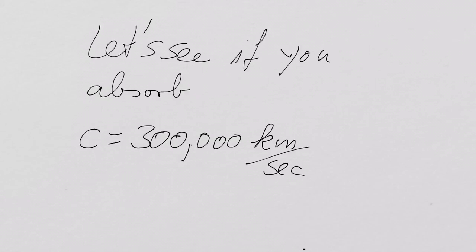Right? Okay, so that is basically how electromagnetic radiation interacts with matter. How can we use this? Now, let's do a little experiment. Let's say we have a container, and in this container is a liquid, and this liquid contains little red molecules.